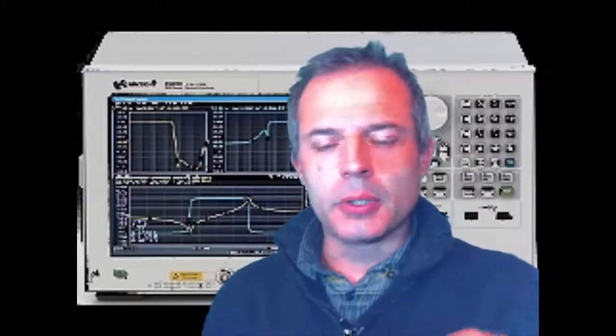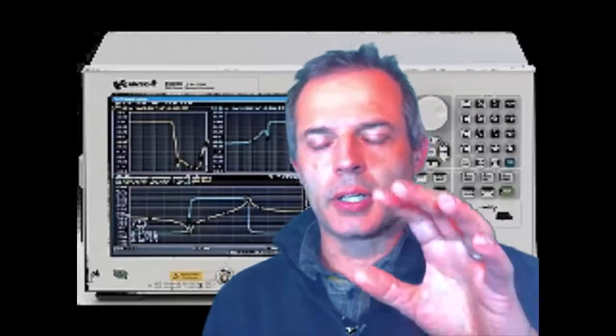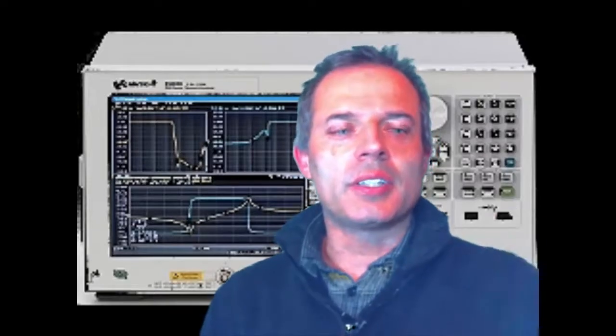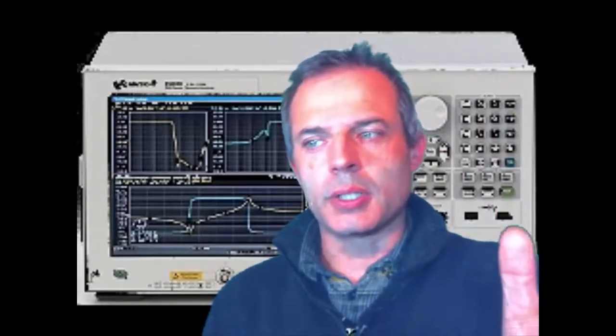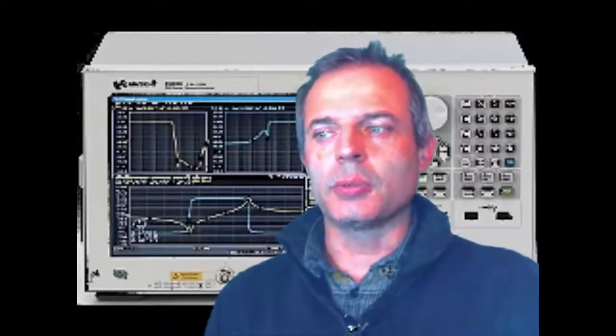Back. We're going to go into the lab now and have a look at some crystal devices and a network analyzer. The network analyzer is a machine, a piece of electronics, that sends an AC of varying frequency to our sample. So it sends an AC frequency and then it steps up and sends another one, keeps going, sends it to the sample and measures back whether that's distorted, how it's distorted, what comes back.